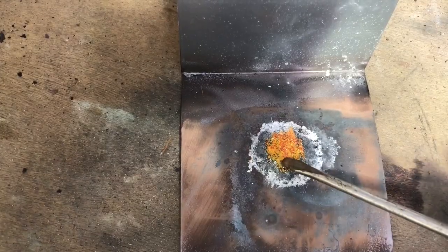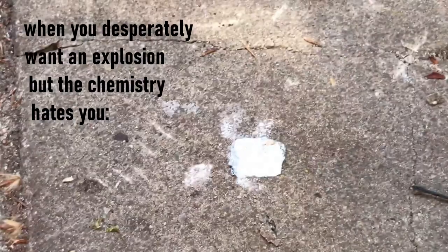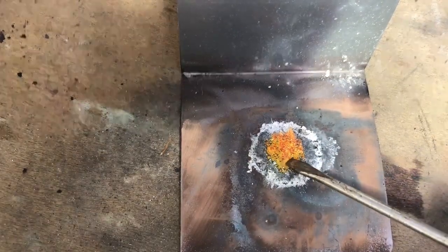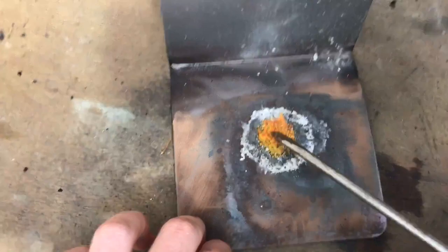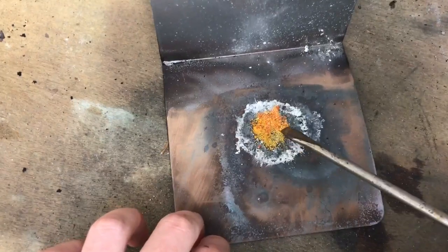Nice. But before I scrape off the powder and test if it has any explosive properties, I wanted to do a little sensitivity test so I don't blow off my face, you know? So, as you can see, it isn't really that sensitive. I mean, it probably isn't sensitive at all. So, I'm safe just scraping it off carelessly off of the plate. Let's do that and test if it is flammable at all or explosive or whatever.